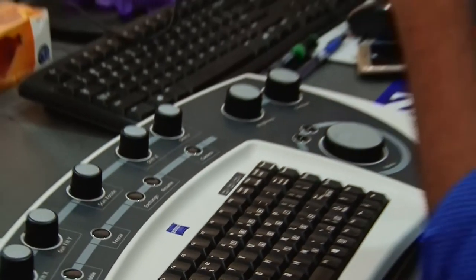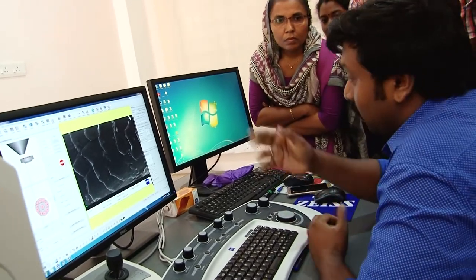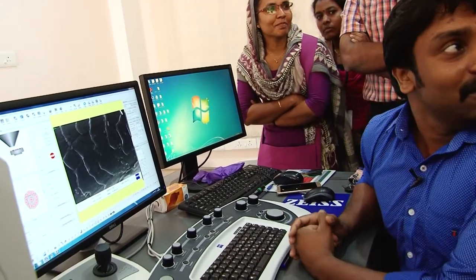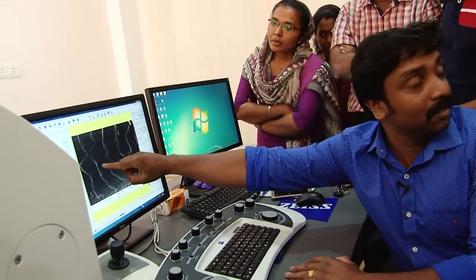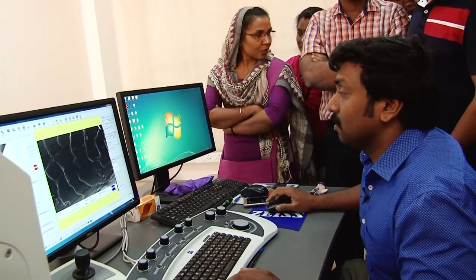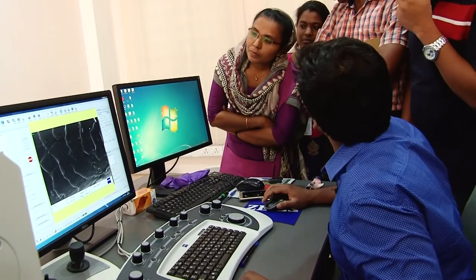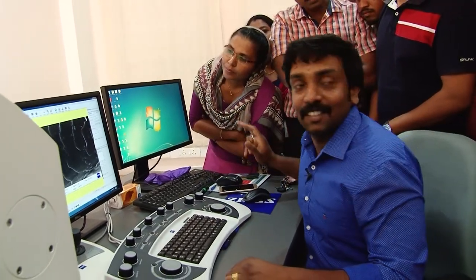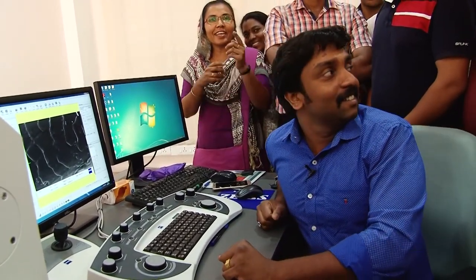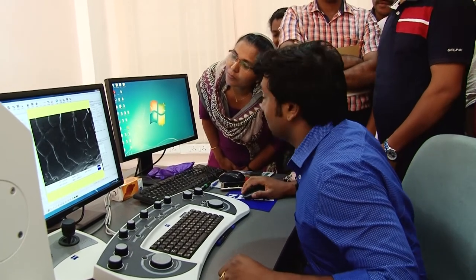This is how gray hair looks like. Maybe some of you are from zoology, so you might have a better idea about this. Anyone from zoology? Hair sample. So what might be these things? This is a gray hair. And we are saving the image now. Anybody knows about this? Could you please come forward to explain what this is?